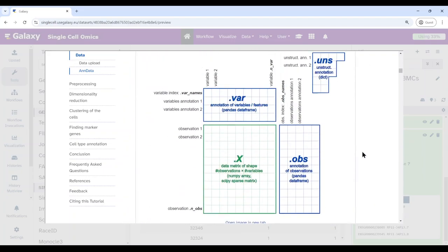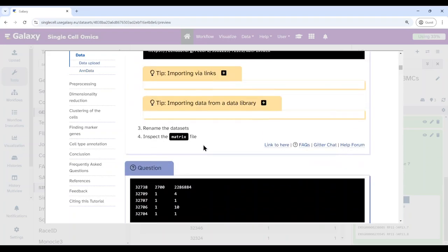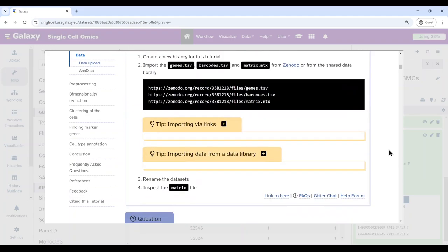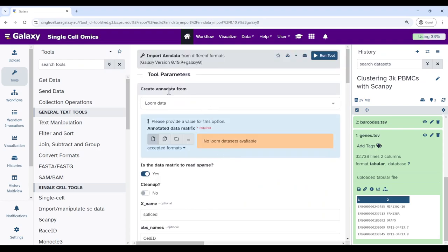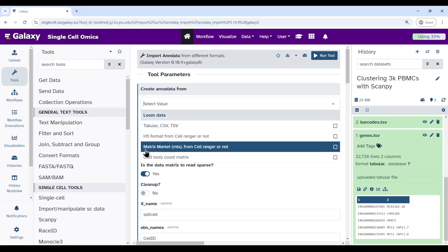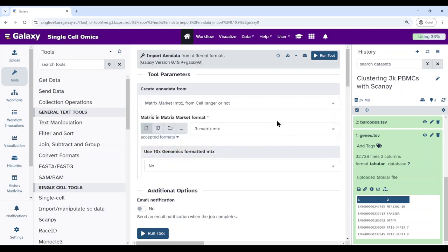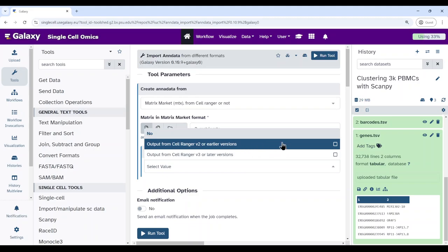To create an AnnData object from our three files, we use the Import AnnData tool. Click on this — if you're inside the GTN within Galaxy, that should open the tool. Now select 'create AnnData from matrix market and from Cell Ranger'. The matrix is already loaded. Then specify the format of the barcodes and genes files — we know it was generated from Cell Ranger v2.